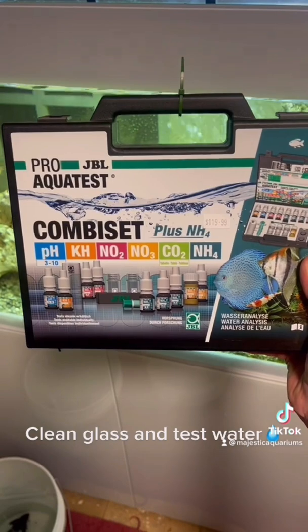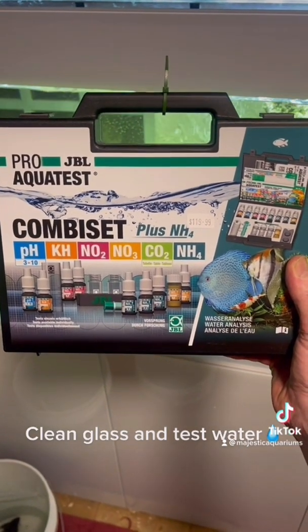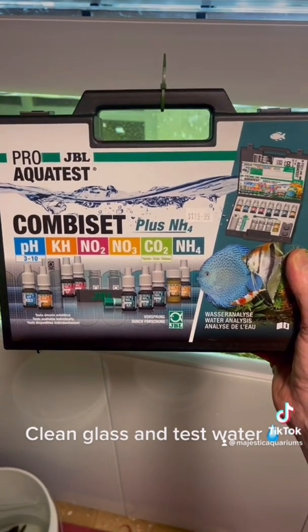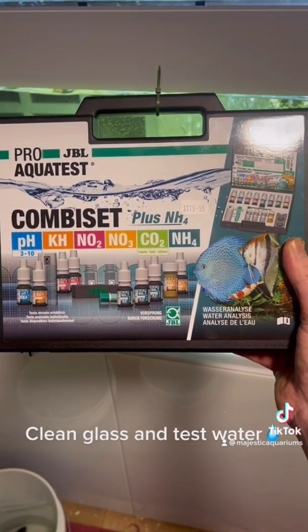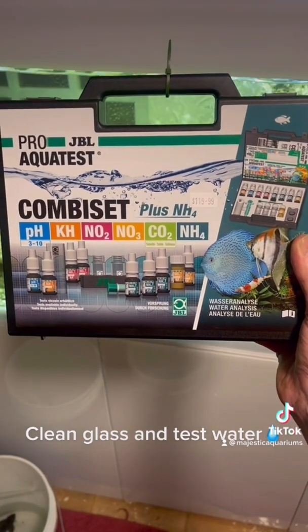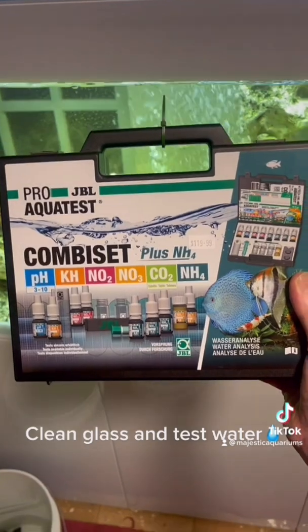I'm going to test the pH, which is going to be the acidity of the water. I'm going to check the KH. The KH will help to stabilize the pH. The NO2, which is nitrite. The NO3, which is nitrate. Probably won't bother checking the CO2 because there's no plants in this tank. I might check the GH and definitely check the ammonia.